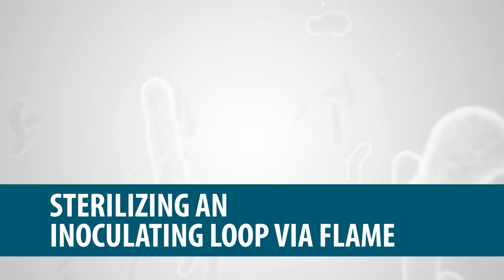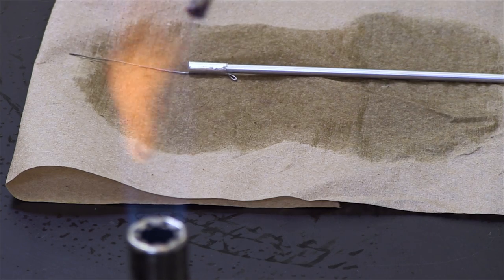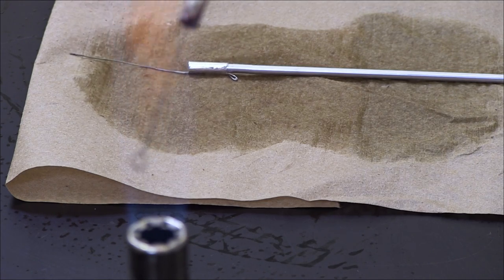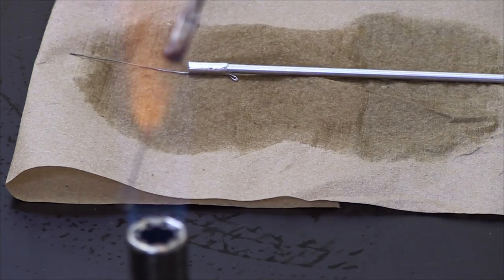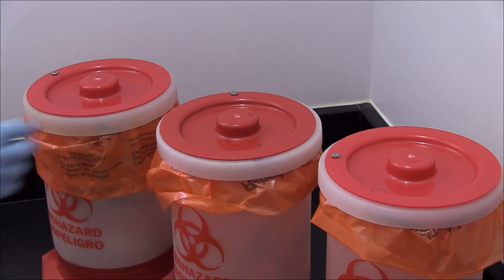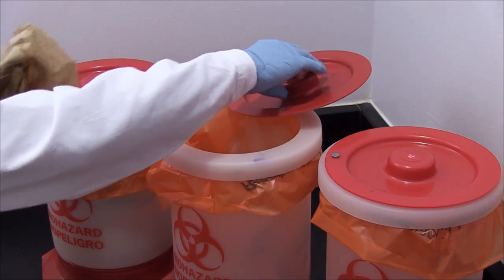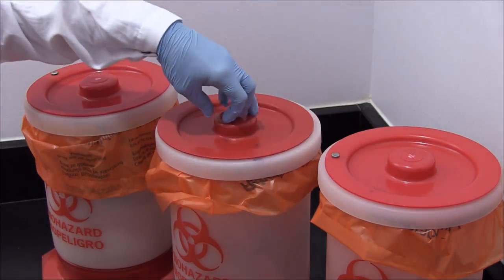Sterilizing an inoculating loop via a flame: sterilize the inoculating tool to complete the process. Discard all contaminated tools and waste into a biohazardous container and disinfect the bench.